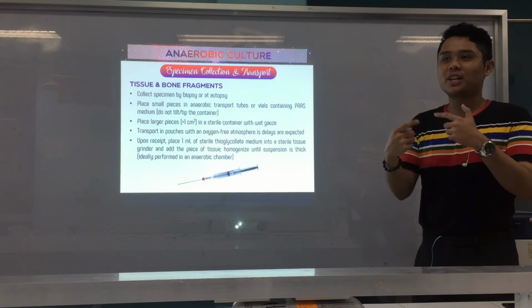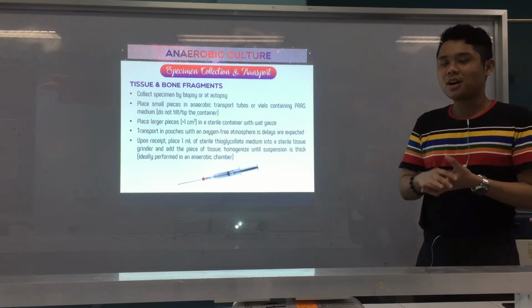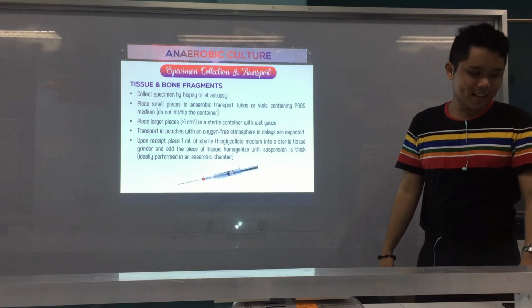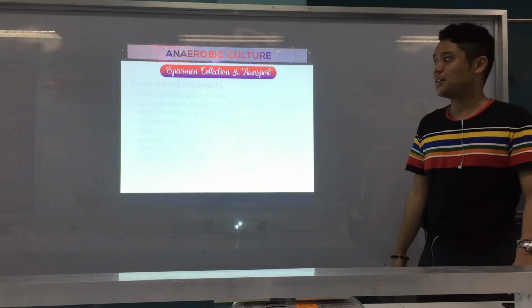Okay. Homogenize until suspension is thick. So, imo siyang i-homogenize, imo siyang durugon. Okay? Alright? Using a grinder ba or vortex or other instrument. Okay. Alright. And again, preferably dapat in an anaerobic chamber. Still the same para walay oxygen na ma-introduce.